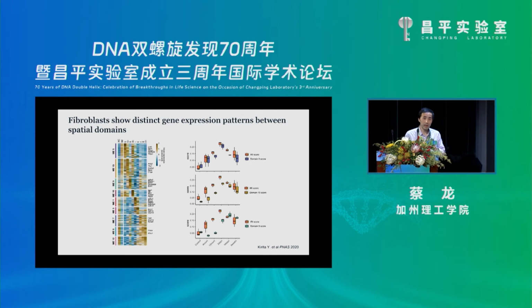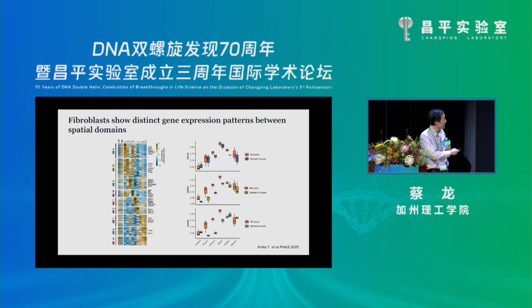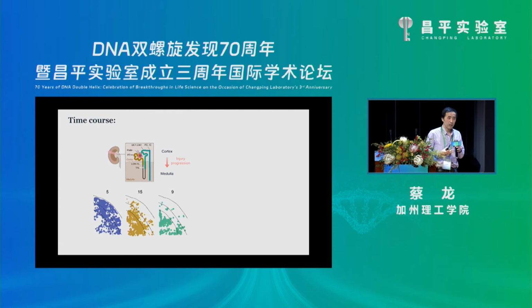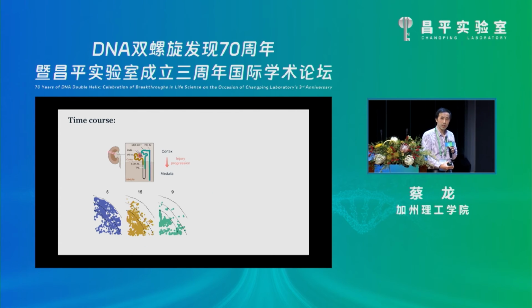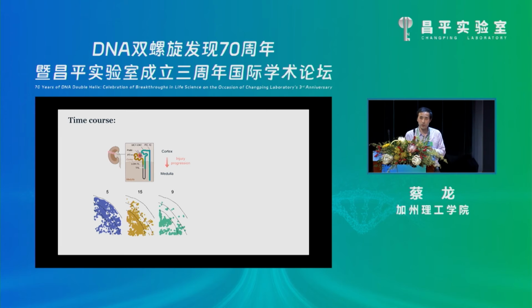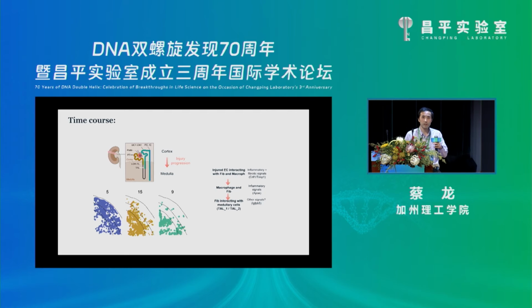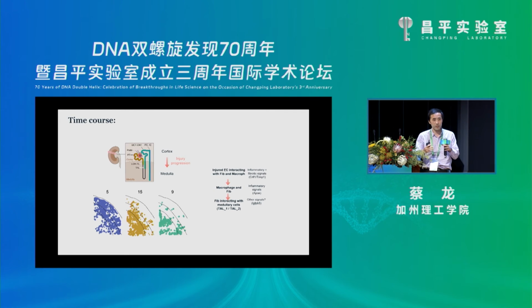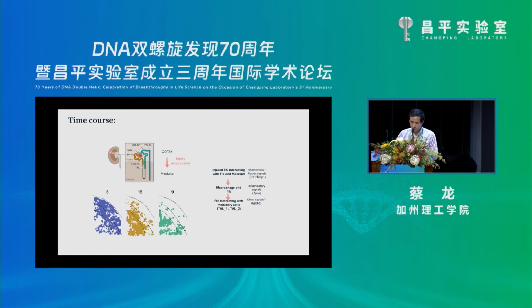And that's something that you don't extract out from the RNA-seq data itself. But fundamentally, what you see is that within the single snapshot at about a month after injury, it actually contains multiple stages of injury, and they correspond to different signals and different recruitment of fibroblasts, injured cells, and macrophages in the tissue.